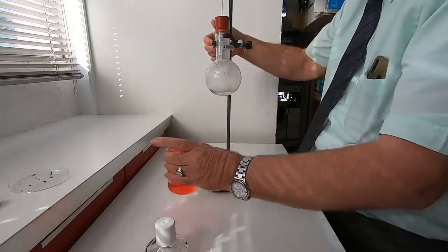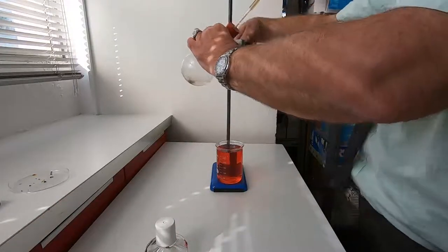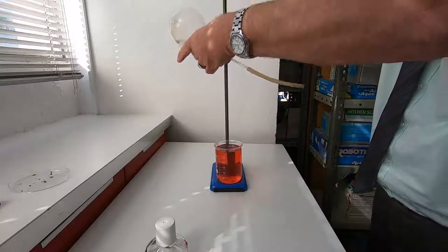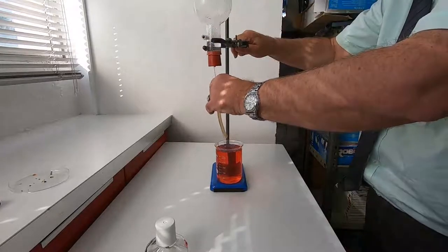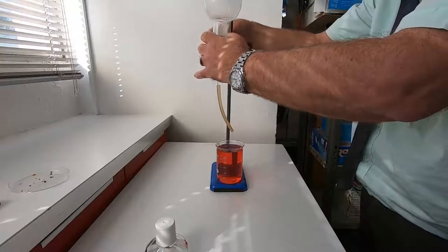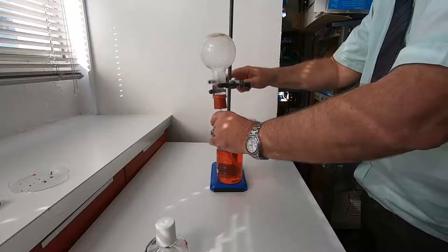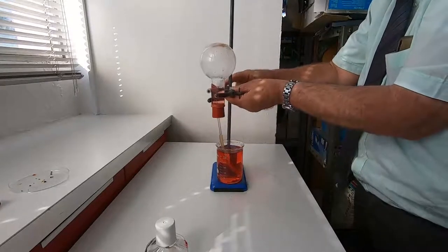I need the water underneath and now I just tip this upside down — just being careful because it's very, very hot. The water runs out a little bit but I need to drop this down, and it goes all the way down into the water.